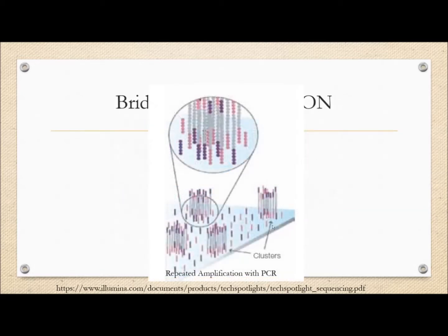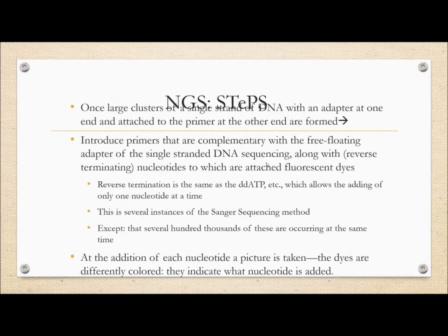So you see these little clusters, these clusters and repeated amplification. But this is the notion of bridge amplification, and you can look at this PDF from which some of these pictures are taken, and the movie also showed you this in better detail.